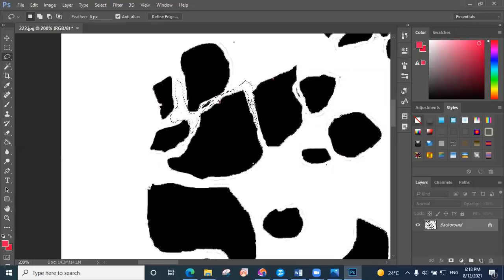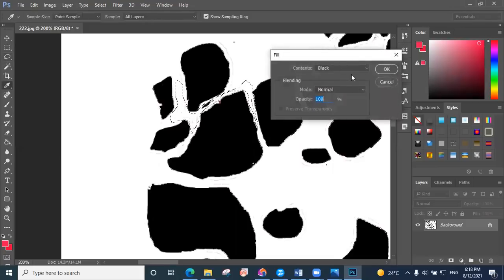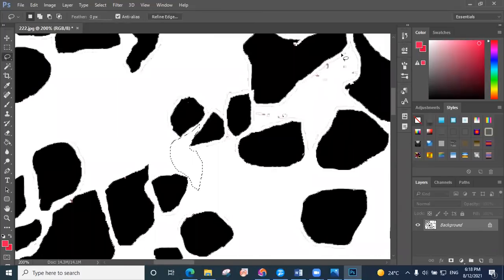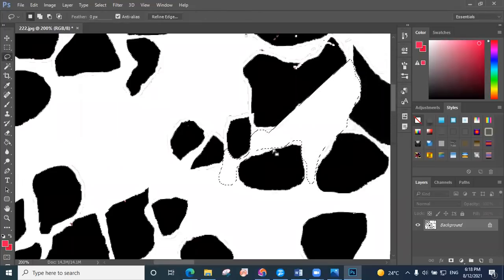See here, just press backspace and then change the color to white to clear it. And then we're almost done. Don't worry, only a few minutes left to see the good result of your hard work. So just be patient.